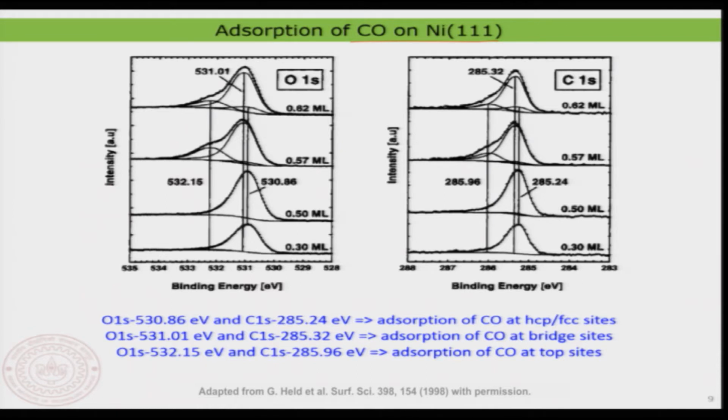Now we can try to understand it a bit more carefully. Something else you can do with the spectrum: we know that the intensity of the resonance at lower coverage corresponds to the amount of molecules occupying the HCP site. So, at this coverage I can say that 100% of the molecules are occupied at the HCP site. This is HCP or FCC site; I am not distinguishing them here, as it is hard to distinguish them with XPS.